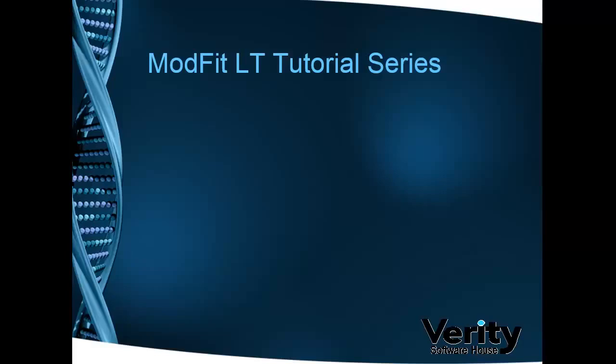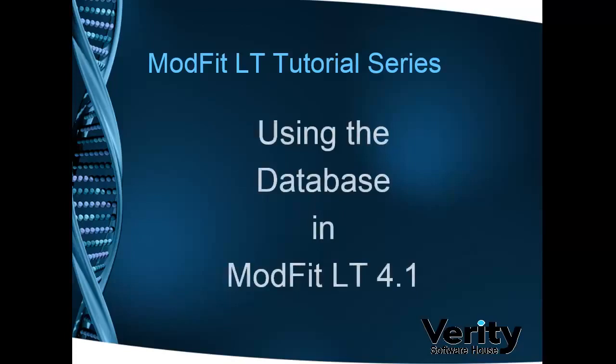ModFit LT has a comprehensive database engine that allows you to easily store large amounts of data. Databases are created in a simple text format known as tab-delimited ASCII text, which can be read by common database and spreadsheet programs. Please note that creating and editing databases is available only to advanced users and administrative users. Standard users do not have access to the Edit Keyword Map dialog.